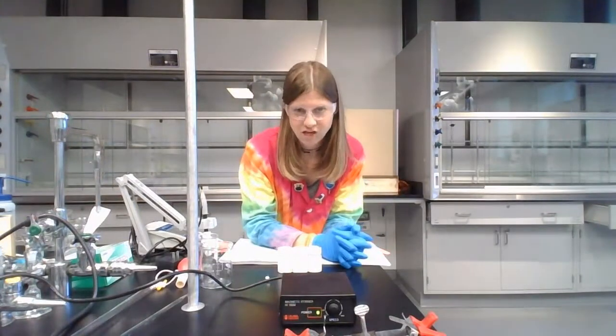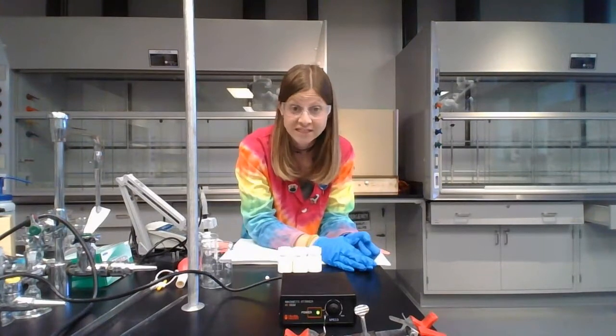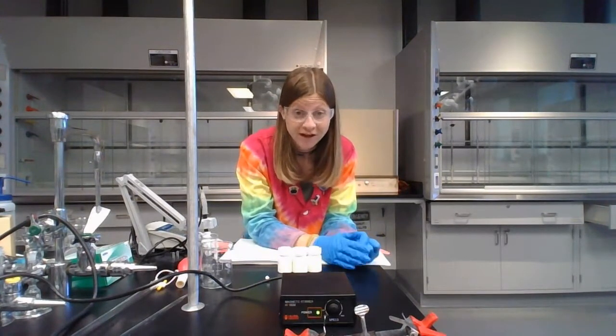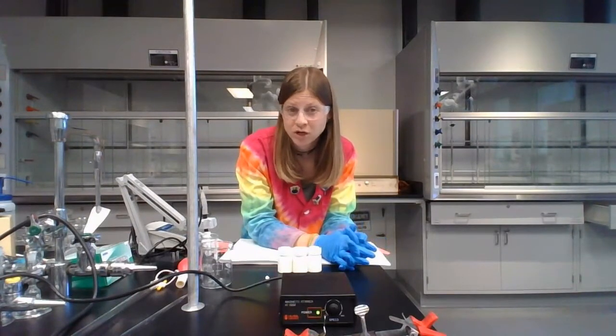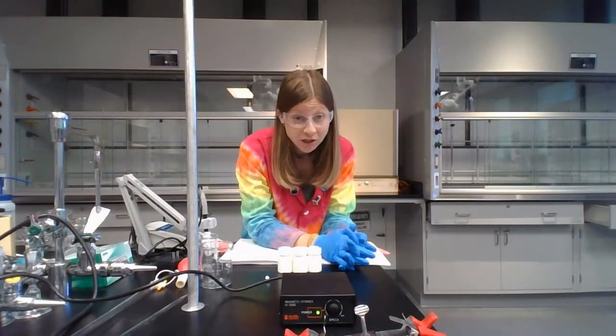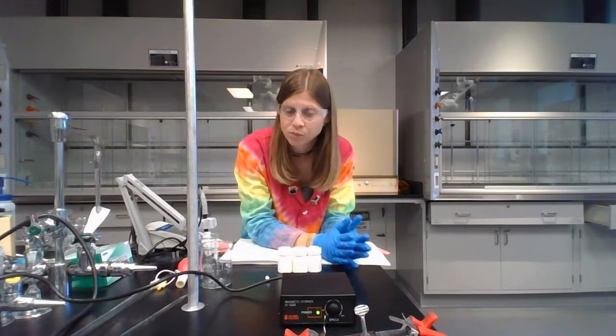This is the lab lecture video for the procedure of the determination of the dissociation constant of a weak acid. Check out the video about the calculations and the background theory for information on those. You'll also need to watch the video about using the pH meter.